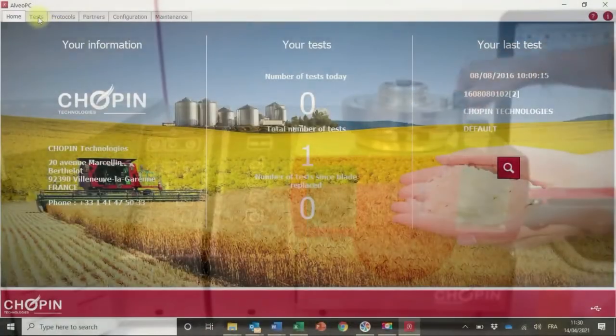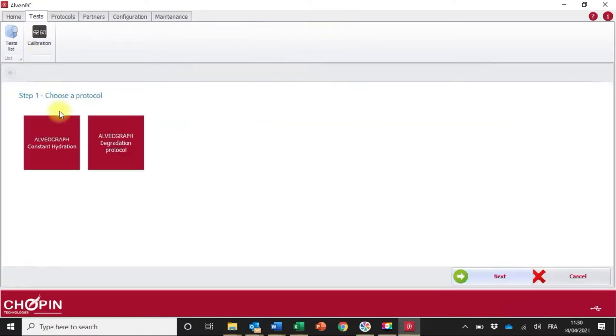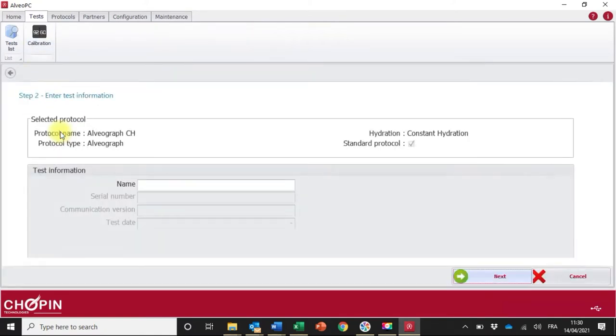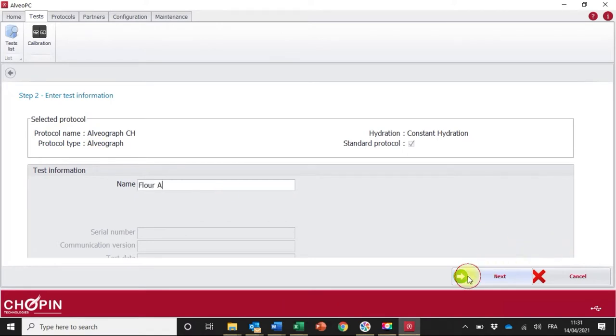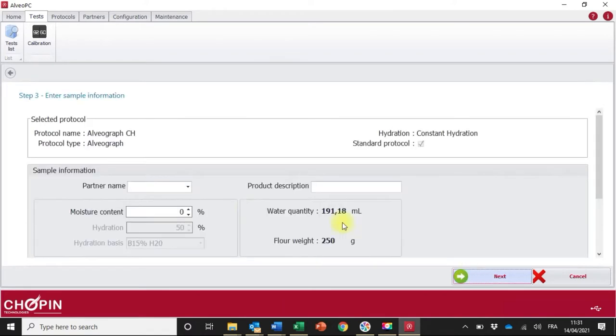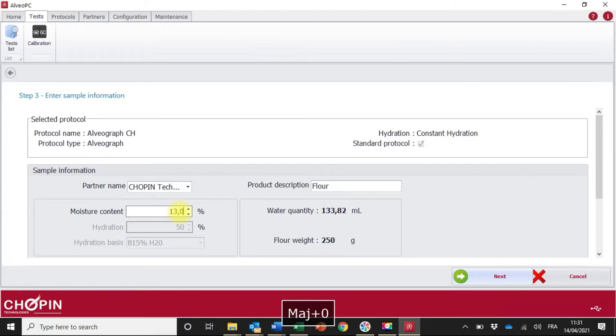In order to run a test you need to configure the test within the software. Click on test then on start a test. Select your protocol. In this case I will be demonstrating the standard test at constant hydration. Enter the name of the test, select a partner and a product, and indicate the water content of the flour. Click on next to open a test window.